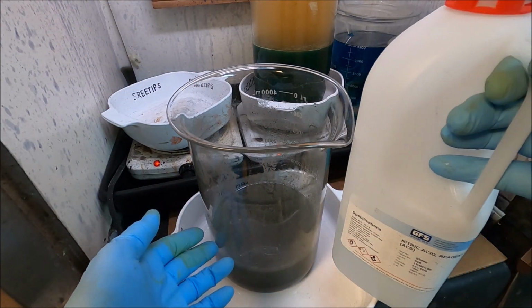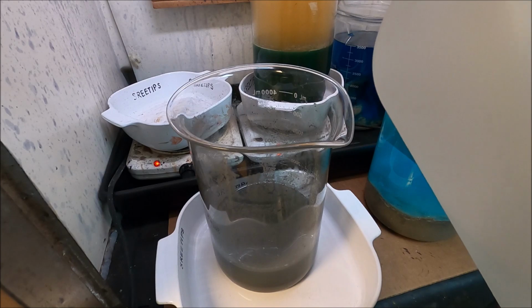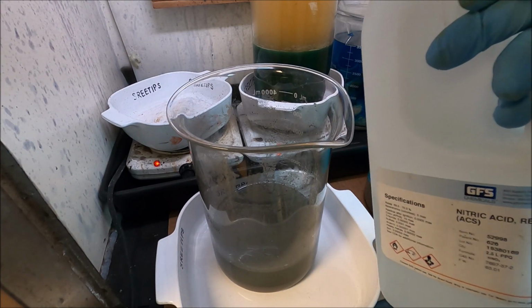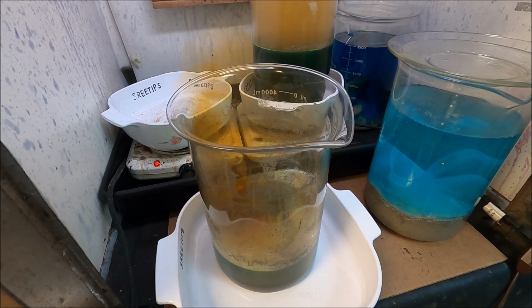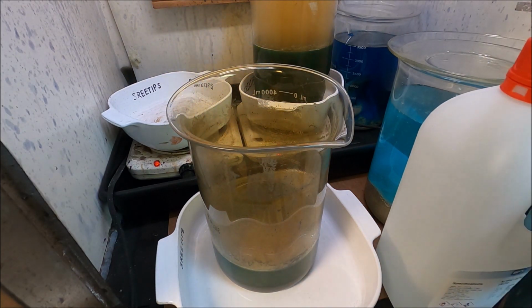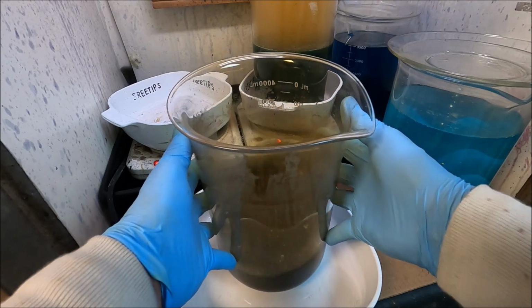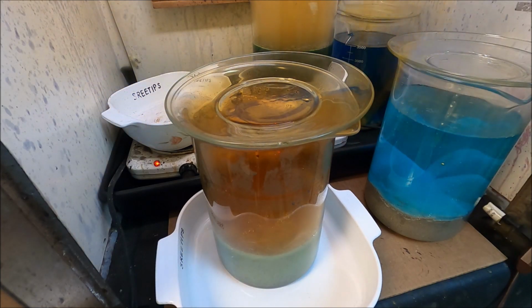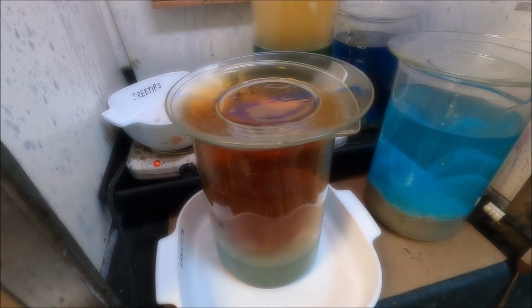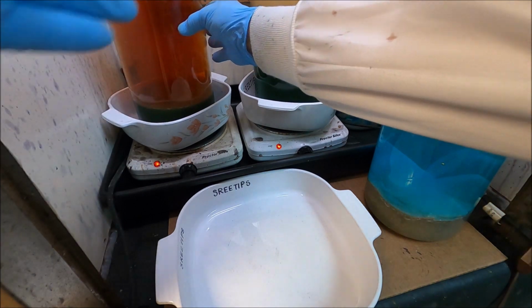So now I'm going to extract any silver that might be in this finely divided material down in this beaker. I'm going to add a little bit of nitric acid here. Oh yeah, look at that. Definitely got some precious metals in there, some silver, maybe some palladium. This is a finely divided material, so it's going to have a tendency to flare up when we add our nitric acid to it. And I'm going to put this up on our hot plate back here and let it slowly start heating up.